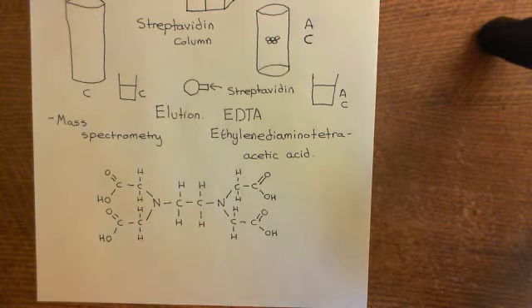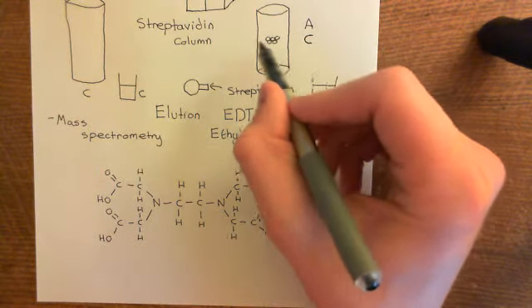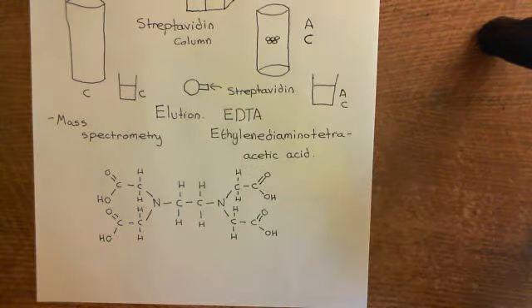Okay, so let's think this through. We started off with these three proteins, A, B, and C, and protein A was the only one with palmitoyl groups stuck on. Now, the way we have set up this acyl-biotin exchange chemistry, you replace palmitoyl groups with this BMCC molecule, which then has the biotin bound to it. This biotin will bind to the streptavidin protein tetramer on the surface of these beads.